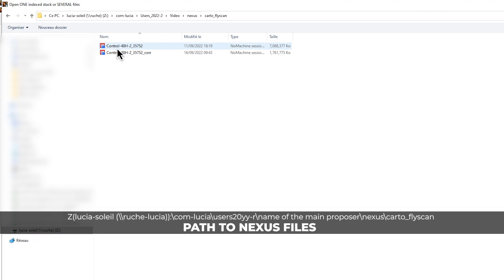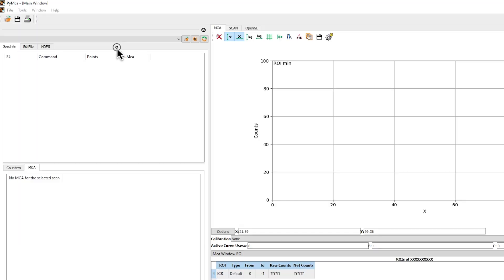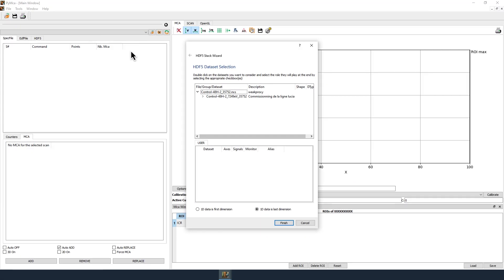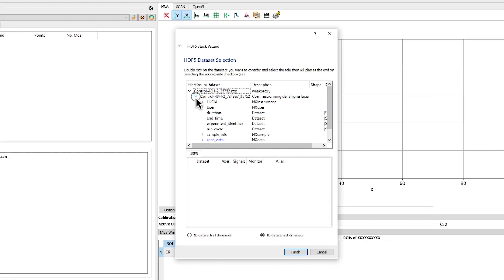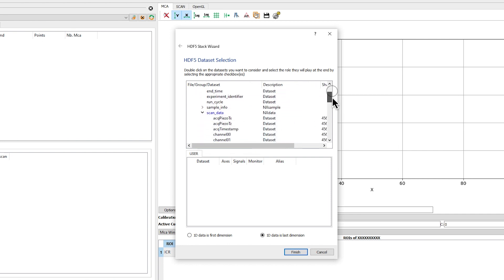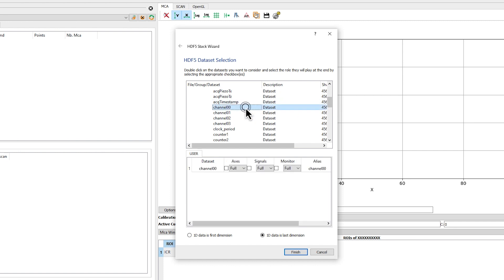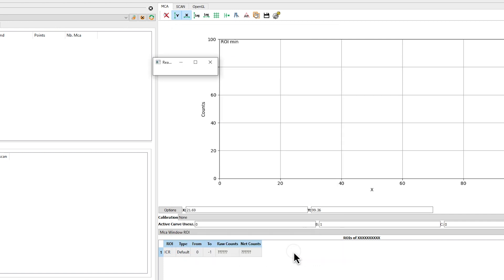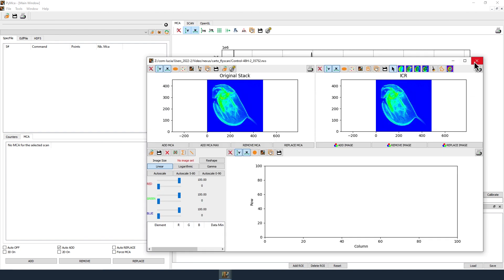In the HDF5 stack wizard window in the user tab, expand the file architecture until the scan underscore data file is open. Double click on channel 00 to select the fluorescence data. Check the signals box and then click on Finish. Depending on the map size and computer capacity, opening the file may take a few seconds. The fluorescence map opens a new window and the sum XRF spectrum is displayed in the main window.